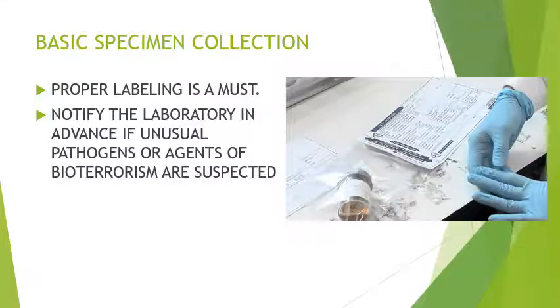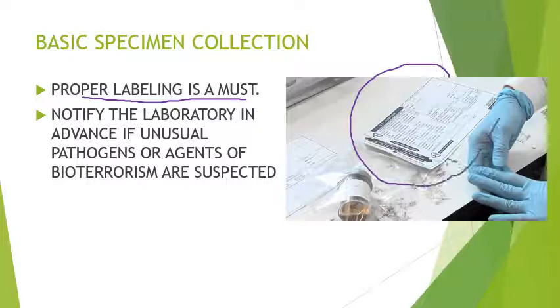Next. Note, proper labeling is a must. No abbreviation. Kailangan gumamit din ng magandang ballpen or magandang pentel pen. Unang-una sa lahat, the label must be equal to the request form. You need to have the same information on your request form and on the specimen bottle.